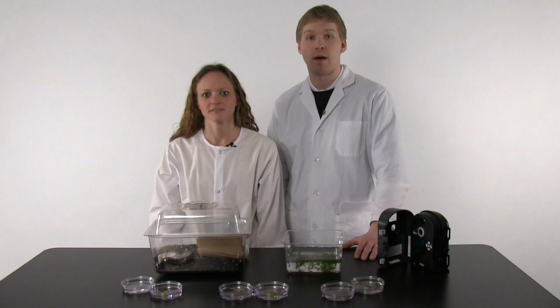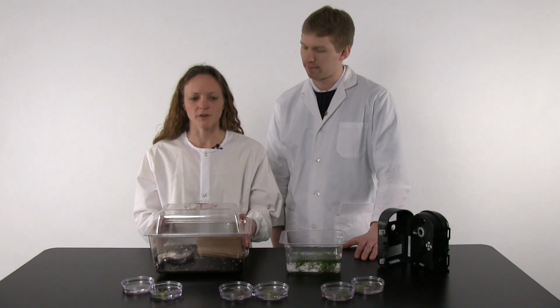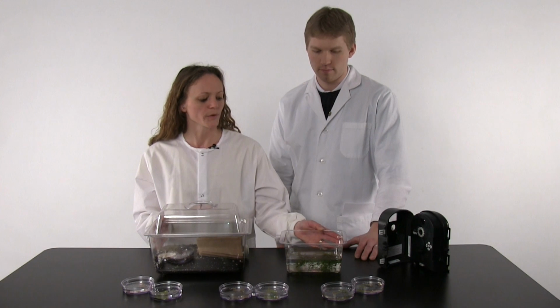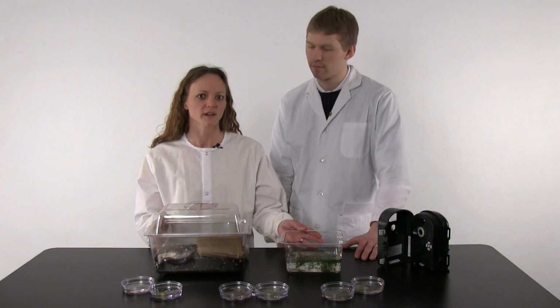Eve and I are going to be doing an observational experiment with sow bugs. We have two different organisms up here, the terrestrial isopods, also known as sow bug and pill bug, and then the aquatic sow bug. We're going to do a brief comparison between the two and then solely focus on the aquatic isopod.